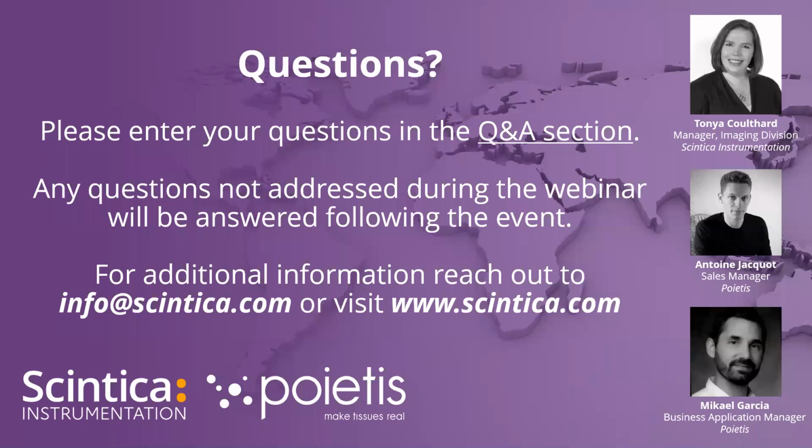The slides themselves can be purchased from Poietis directly with the metal spread on the surface. They can be prepared by yourselves, but you'd need a sputtering gun to apply that metallized surface. And so with different service packs or starter packs coming from Poietis, you have those already prepared and you simply pipette the cells within their media on top of them, and then you're ready to do bioprinting.